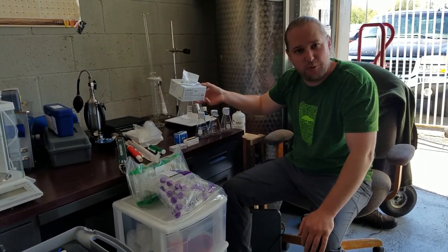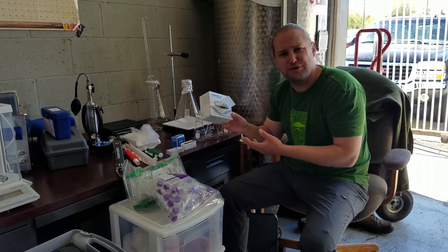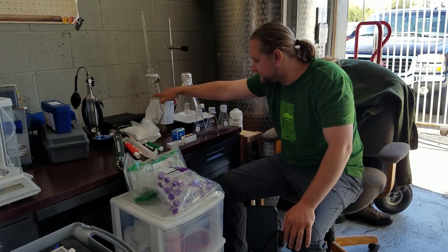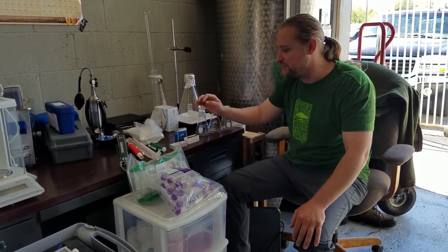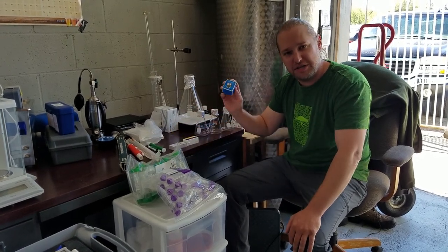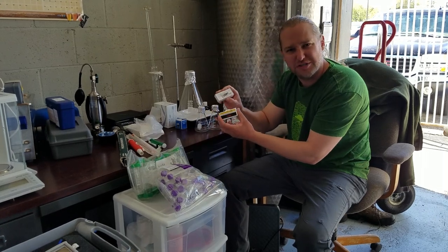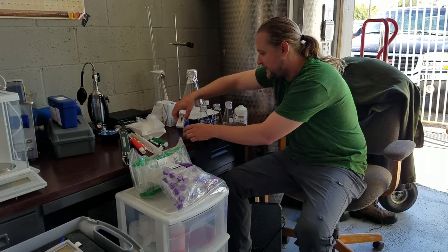We have Kim wipes — it's important to keep some around to wipe off your microscope if you're using immersion oil, or to clean your meters. Then moving into yeast viability and yeast counting: we have a clicker, a little counter, so you can count your yeast cells. We also have our hemocytometer and hemocytometer cover slips, used for viability testing and yeast counting.